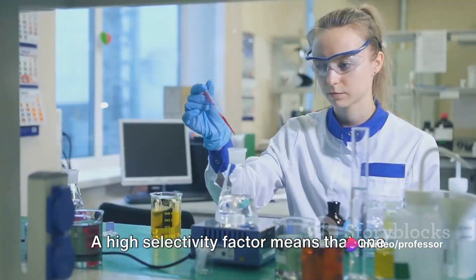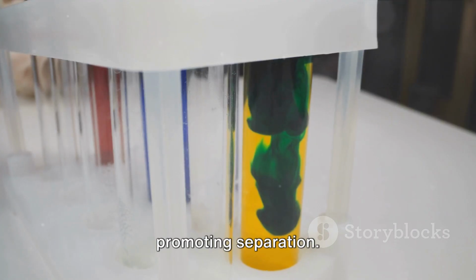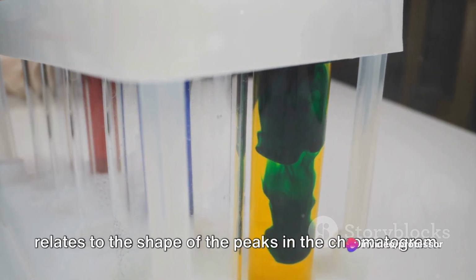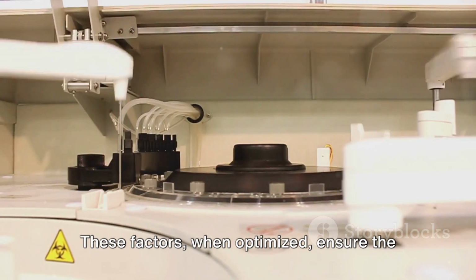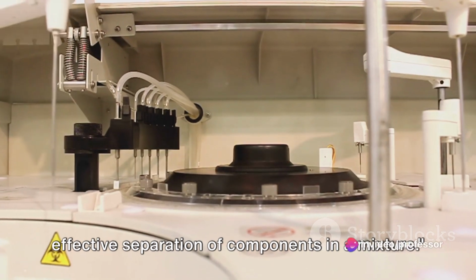A high selectivity factor means that one solute interacts much more strongly with the stationary phase than the other, promoting separation. Lastly, we consider peak symmetry, which relates to the shape of the peaks in the chromatogram. Ideally, peaks should be symmetrical for accurate quantification of the solutes. These factors, when optimized, ensure the effective separation of components in a mixture.